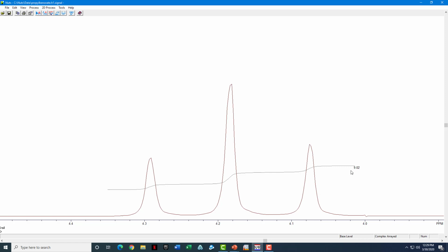So what have we learned so far? Peak heights scale with the number of scans. Integrations scale as the number of scans. But integrations scale better than peak heights. And I want to tell you why right now.